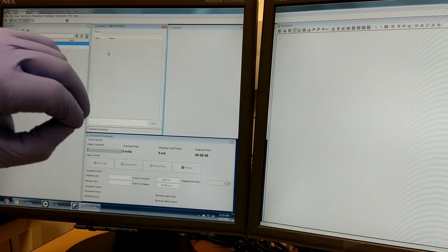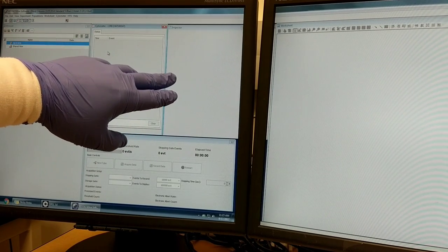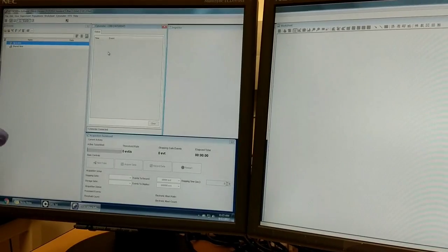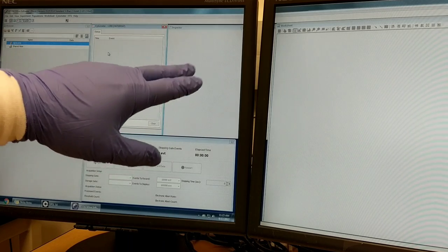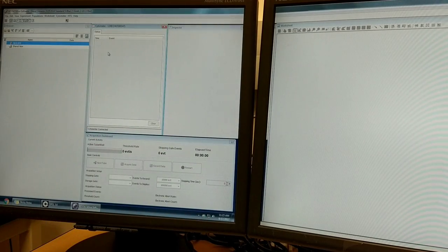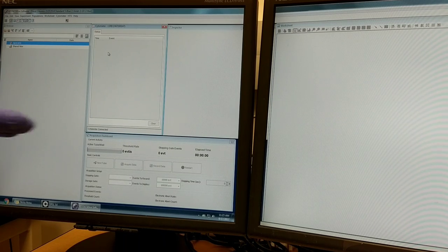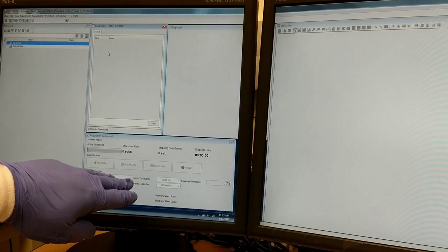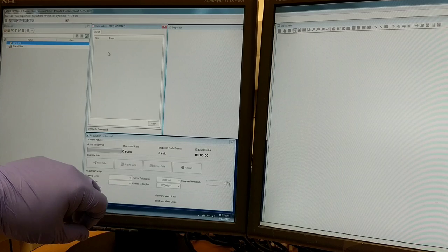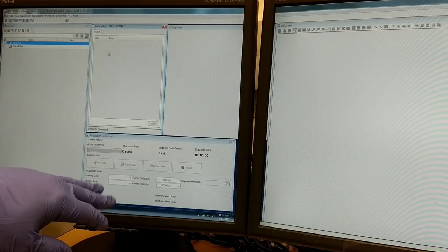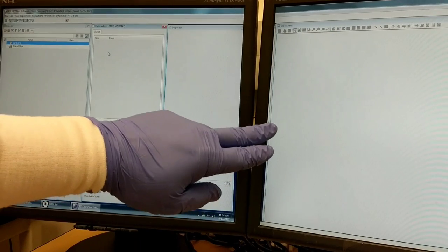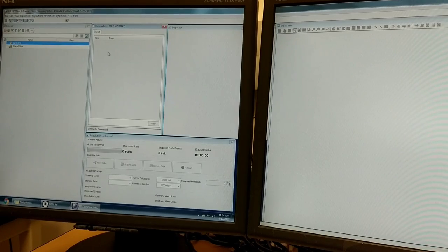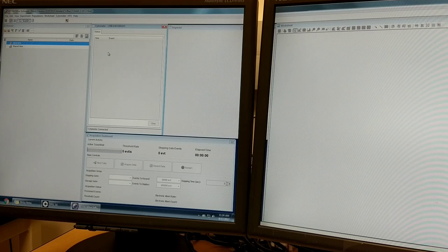The inspector window has information specific to whatever element you're clicked on in Diva. For example, if you're activating a plot in the worksheet, you can see properties of that plot. The acquisition dashboard has all the buttons that control acquisition and recording of data, and the worksheet on the right screen is where you'll see all your plots, such as dot plots and histograms.